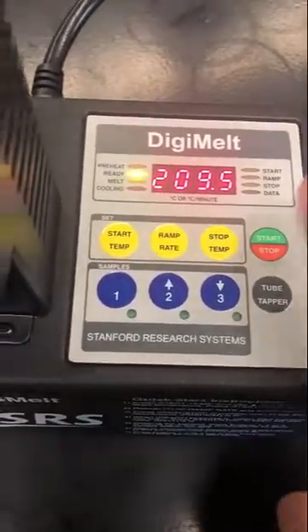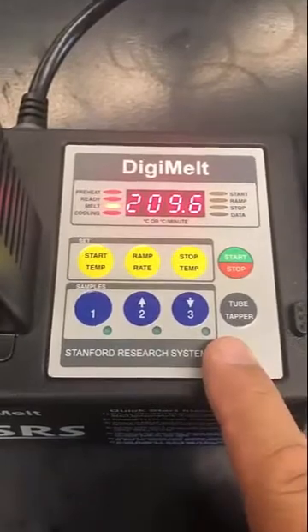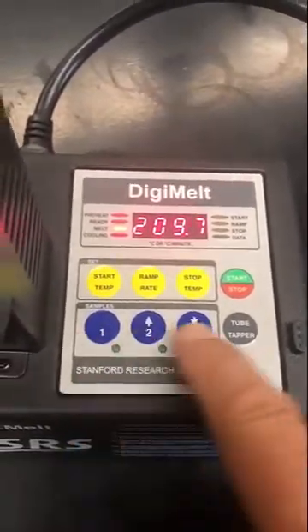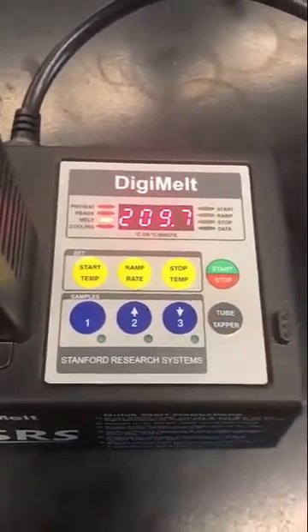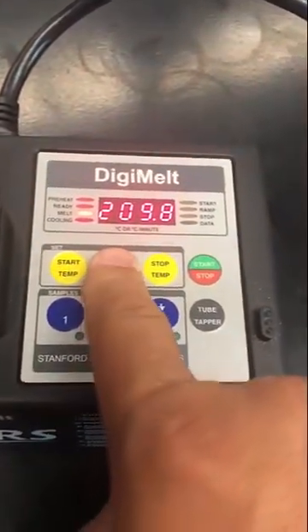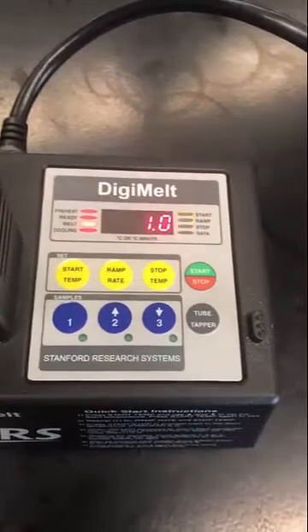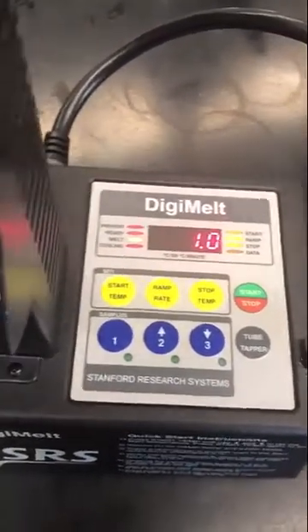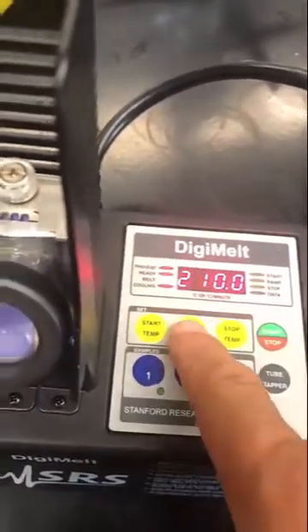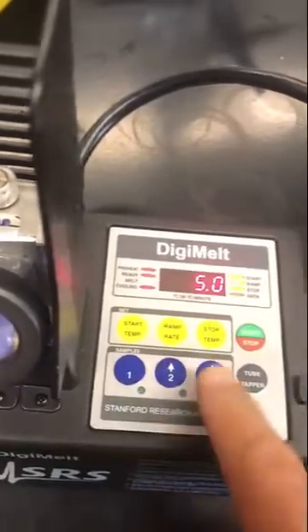Now it's at 209.5 and I'm going to tell it to start. You'll notice there are three buttons here, and the three buttons are for storing information of when a sample melts. The other thing I should mention is the ramp rate. The ramp rate is typically one degree a minute if you're close to the melting point, and typically more than that if you're further away — so you can go at two degrees a minute or five degrees.